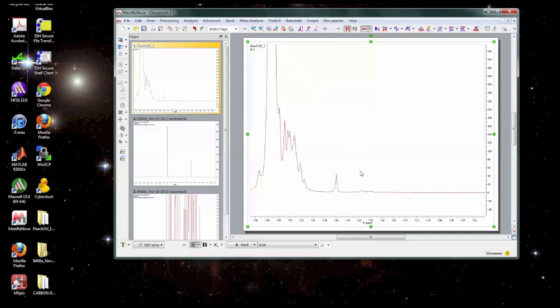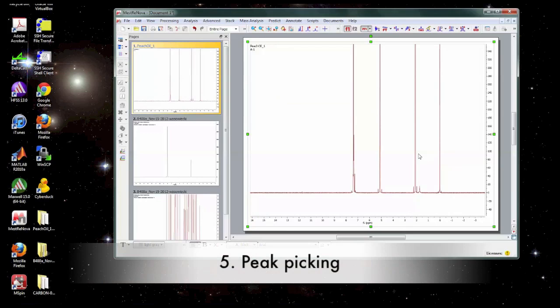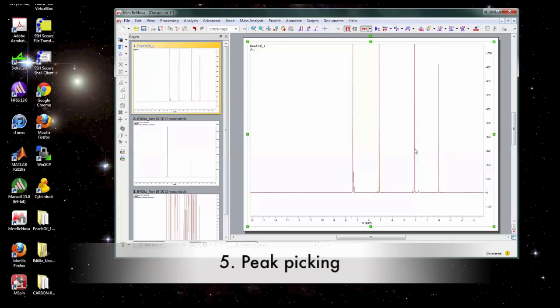When you dissolve different materials in solvents at different concentrations, it can have slight effects on the chemical shift. So long as you reference consistently, it should not be a problem. Okay, now we have our spectrum referenced.